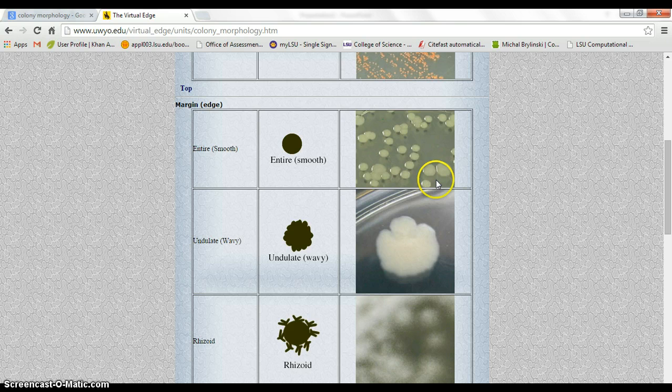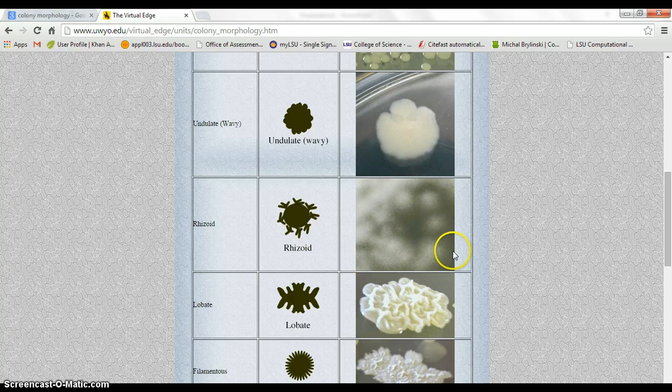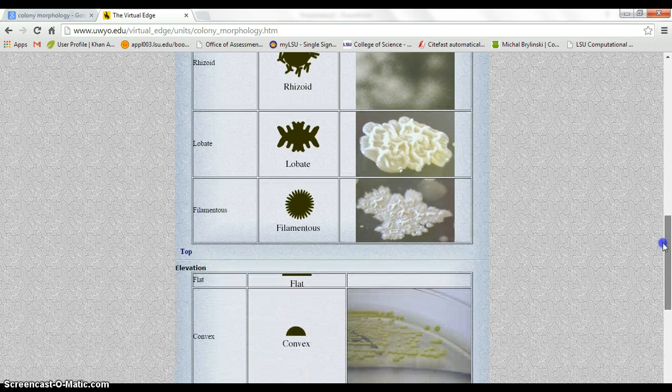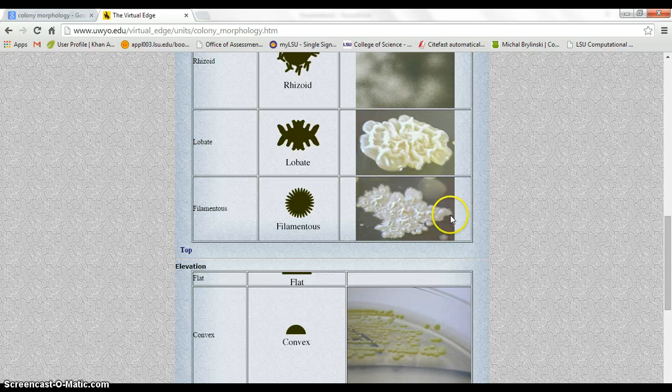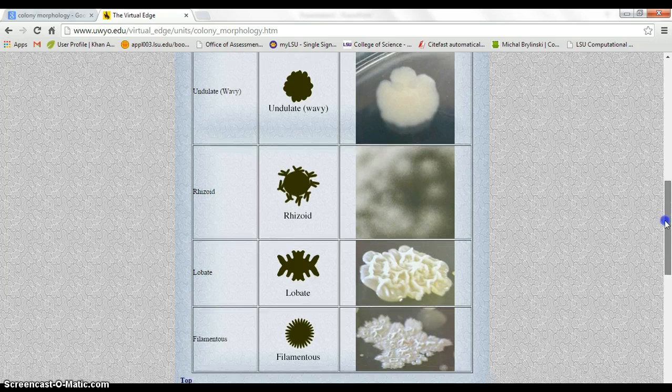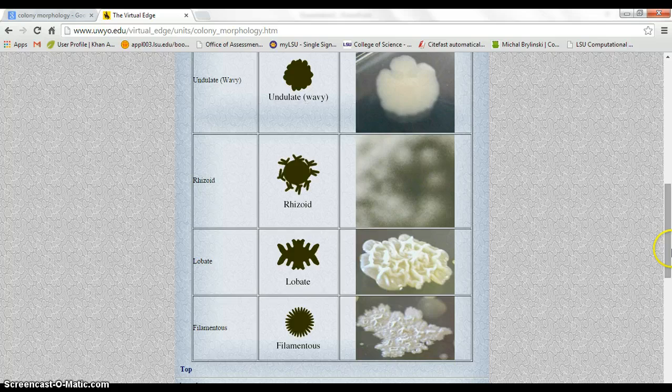Okay, alright, so this one is a smooth thing. Undulate, this is kind of a bad picture. I don't really know why that's here. Lobate, I don't think you need to know that one but I might be wrong, I forgot. Filamentous, again, this is just hard to tell right here. Like, if I were to see this I would think just kind of wavy or irregular or something, I don't know.